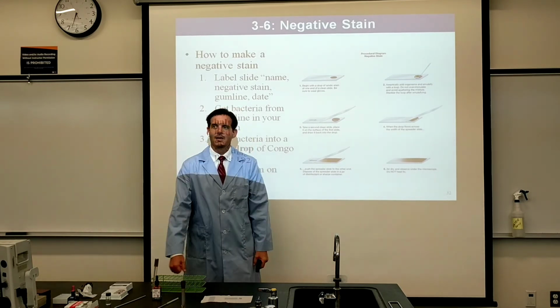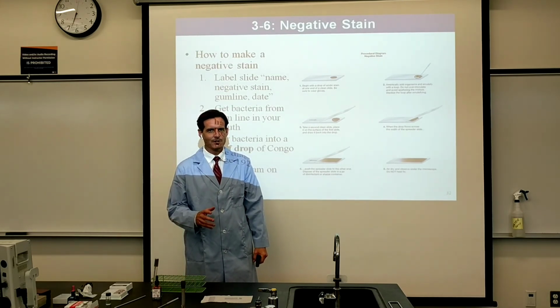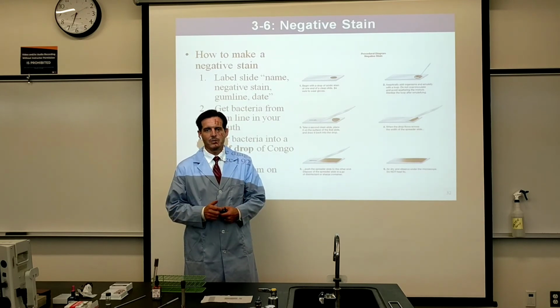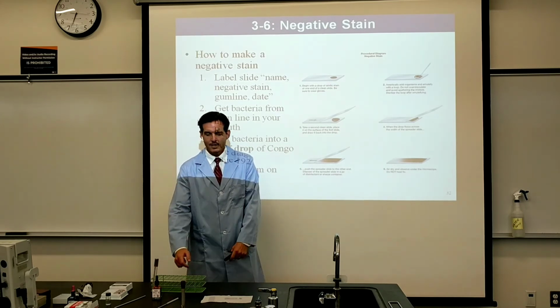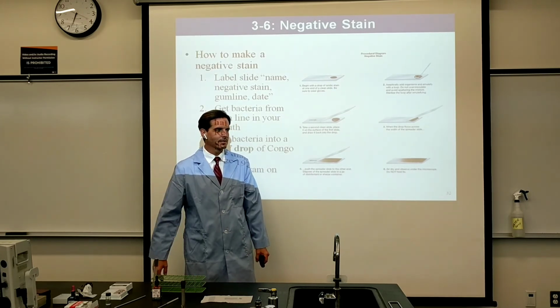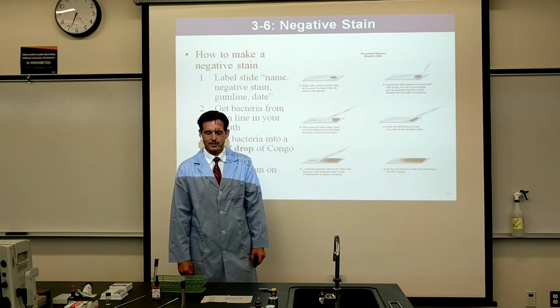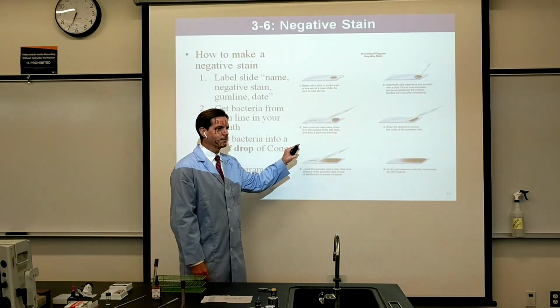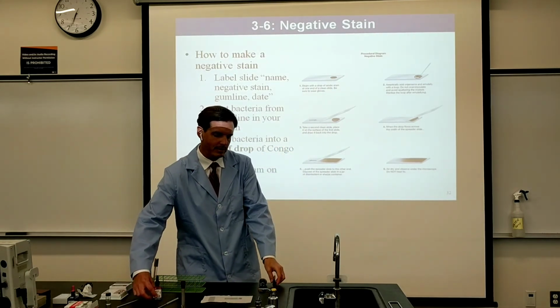The first time I taught this, that was one of the unfortunate things I forgot to mention. And one of my students found some spirochetes from between their teeth. It does not mean you have a disease. It could be normal flora for some people. Not everyone is guaranteed to find these spirochetes, but when the student found those, oh my gosh, that person was so scared they stayed till the class was over, and they're very quiet, and then they finally pointed out what the problem was, and what a scare. Anyway, unnecessary scare, guys. We're not looking for anything terrible. Maybe we'll get lucky and find a spirochete.